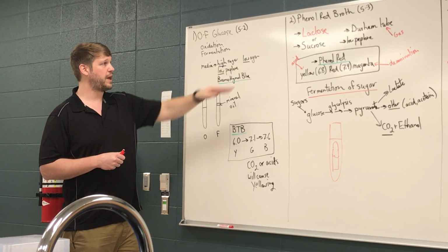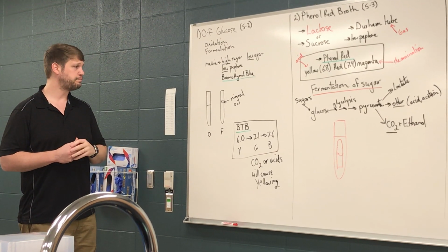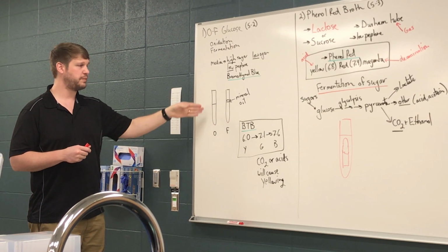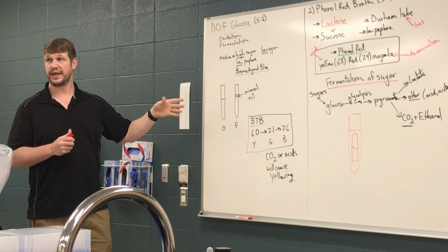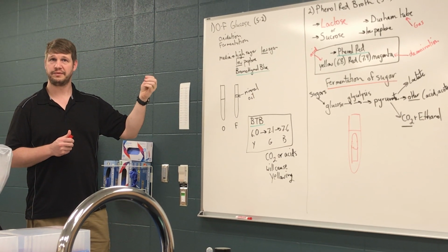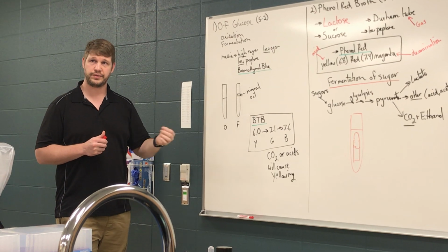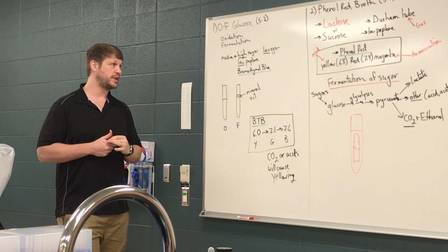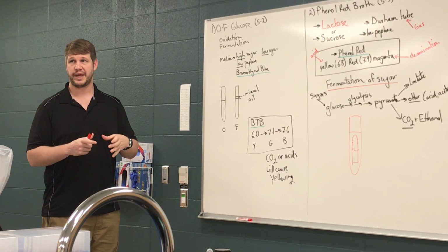This does have a low amount of agar in it, in part to make it a little bit easier to work with, but also to minimize oxygen diffusion. We saw this with the fluid thioglycolate media as well. We put a little bit of agar in there to minimize the diffusion of oxygen through the media. This is a little bit higher agar concentration than FTMs, but it's not like what you would see in a plate.